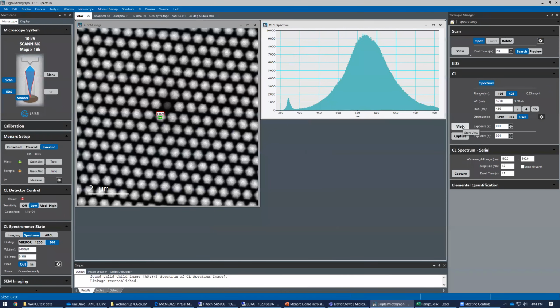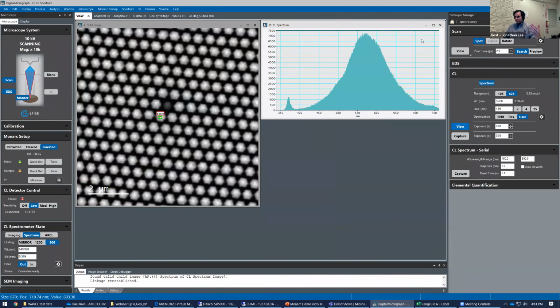So I could go back and forth trying to optimize or find the maximum level of intensity, or I could sit here and just adjust the stage position until I find that the spectrum maxes out, assuming that the spectrum remains constant and that the beam is not spreading out as a function of height, which are flawed assumptions, but typical of this sort of technique.